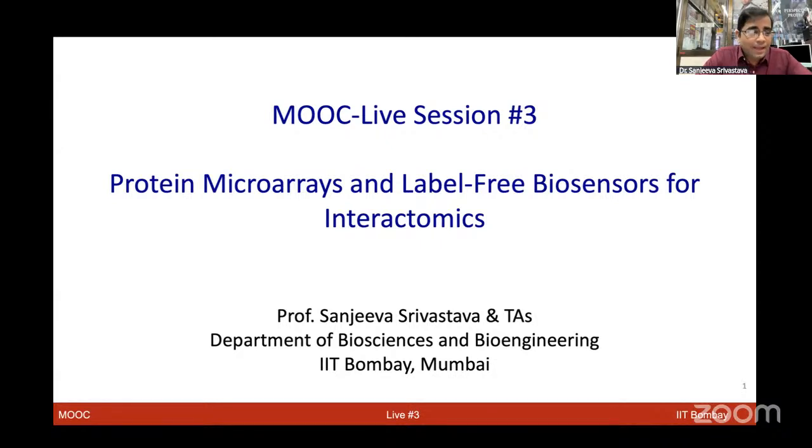Today, we are going to talk about protein microarrays and label-free biosensors, which is the key theme of the Interactomics course. And rather than giving you another lecture about all this technology, which you have been already studying in the course, today the goal is to give you more practical hands-on activities and a live session from the lab to acquaint you with what all goes into doing research in this area, right?